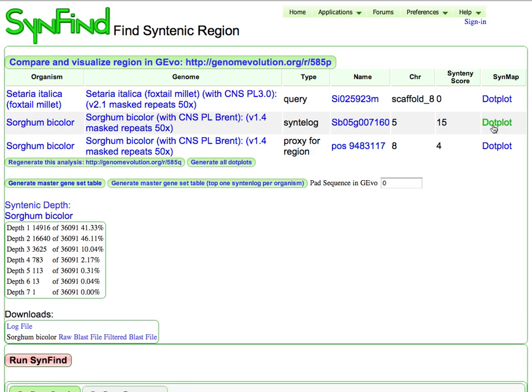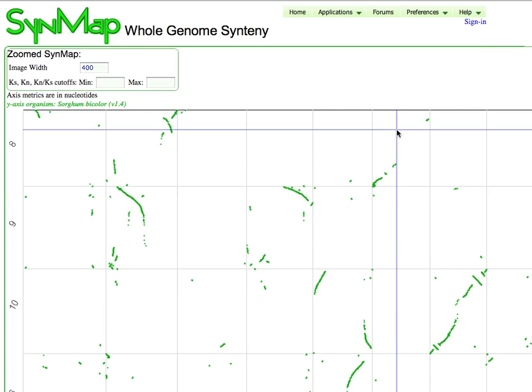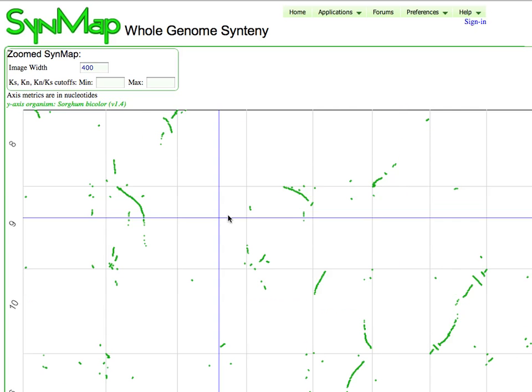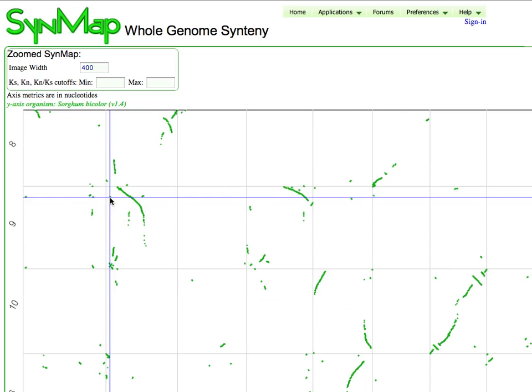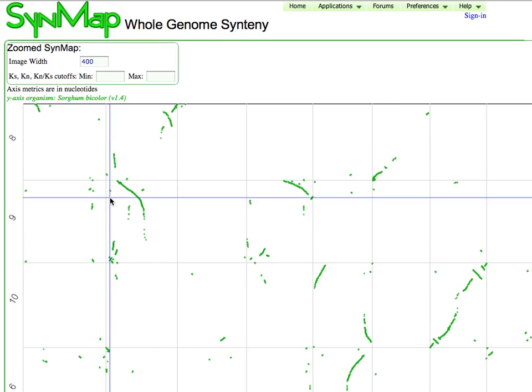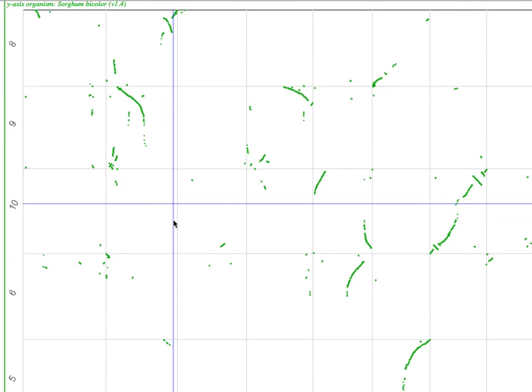But if I want to, I can quickly generate a dot plot. So if I click on this link, dot plot, it will fire up SynMap and automatically start running it with these two genomes. This analysis, again, has been previously run, so the results come back really quickly.